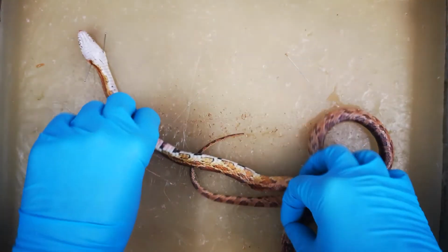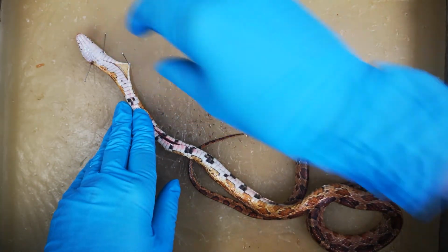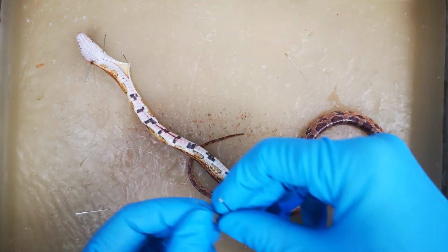We can then pin the rest of the body in place with the flaps of skin. This is a laborious process, but it is worth taking your time.